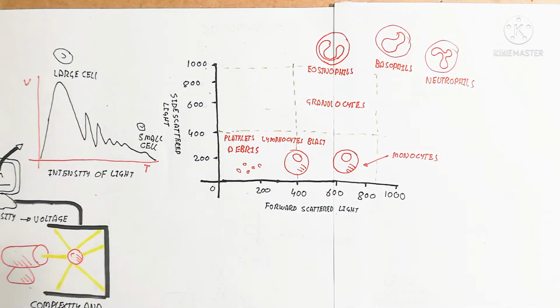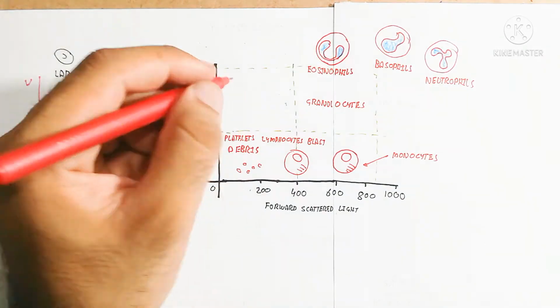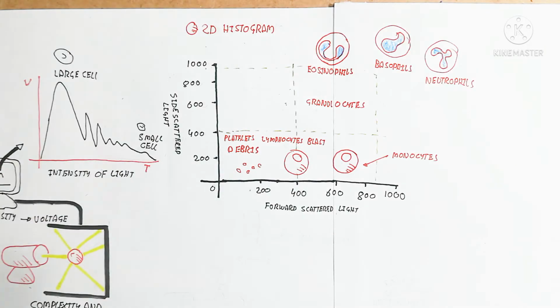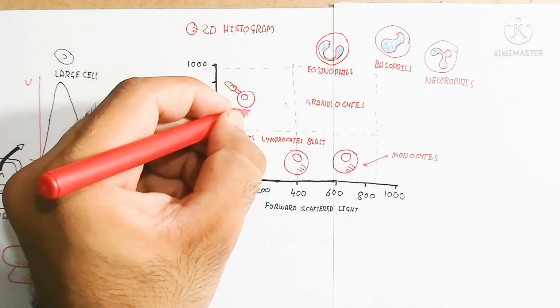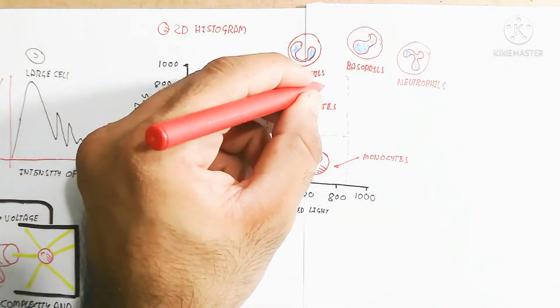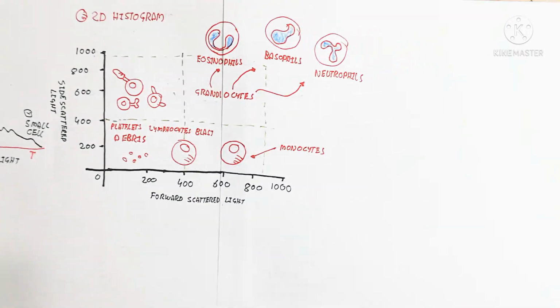So, importantly, it means it is a monocyte and it is smaller. On the other hand, this box shows that the cell is big and complex, because the scattering of the light, side and forward, is wider. So you can see that eosinophil, basophil and neutrophil are complex. Their surface contains different types of protein, and inside are many granules which scatter more light, side and forward wider. So that means we can identify that it is complex.